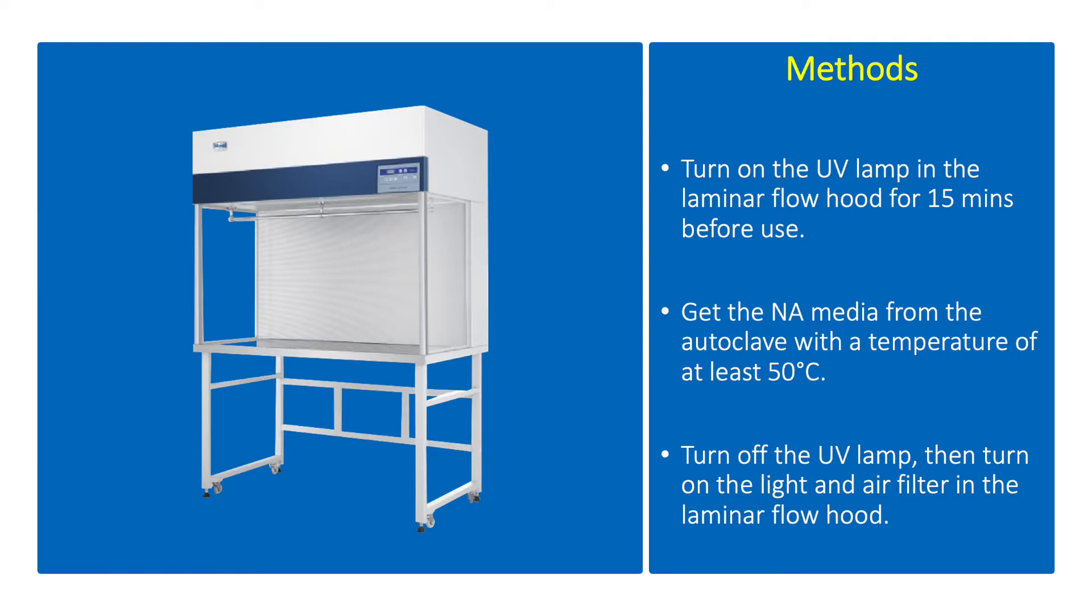Preparation of media in petri plates is commonly performed inside a laminar flow hood. Laminar flow hood filters air and blows the filtered air towards the user to create an aseptic environment during the preparation of culture media inside the laminar flow hood.